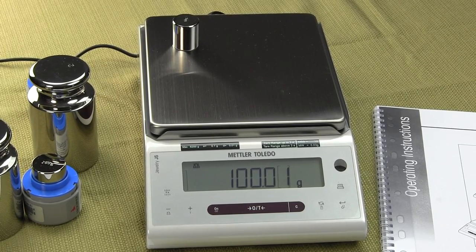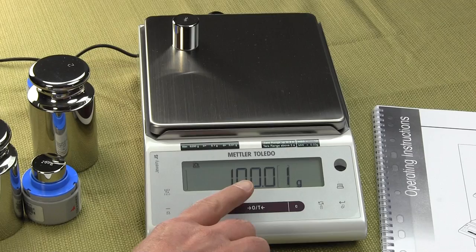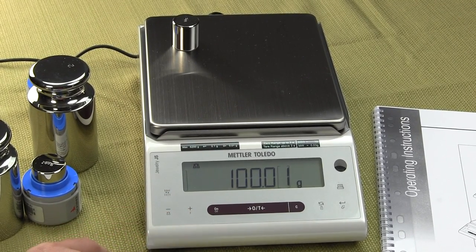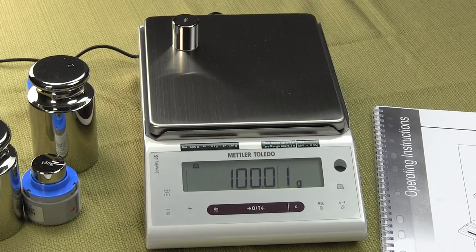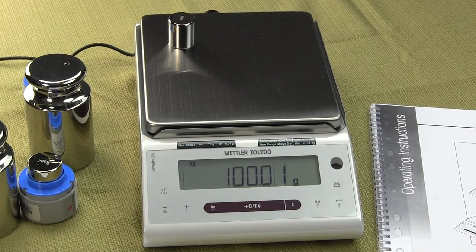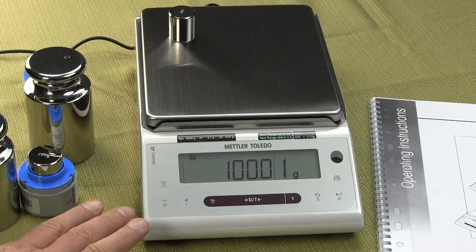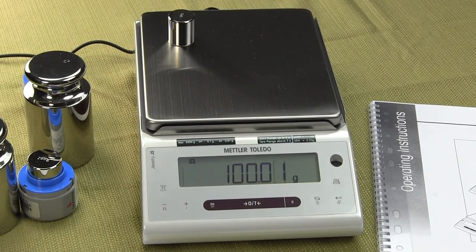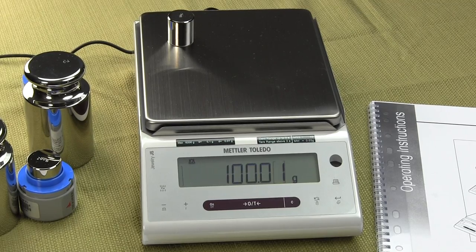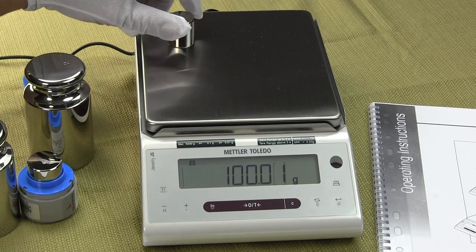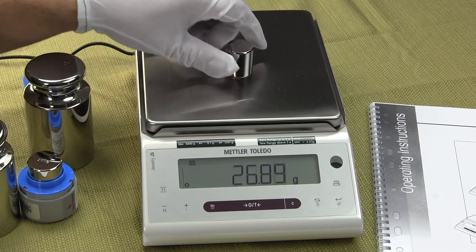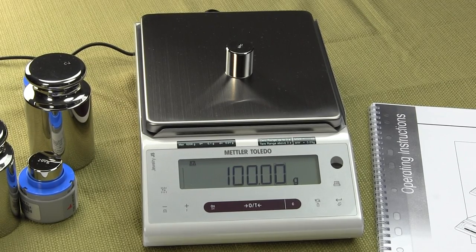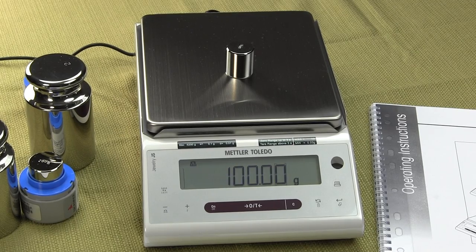This balance has an LCD display with a backlight and the JS series is loaded with features. This balance replaces the JP series. In the JS, you're going to get motorized internal calibration with backlight display. All the models in the JS series are force restoration balances and these balances all incorporate Mettler Toledo monoblock technology.